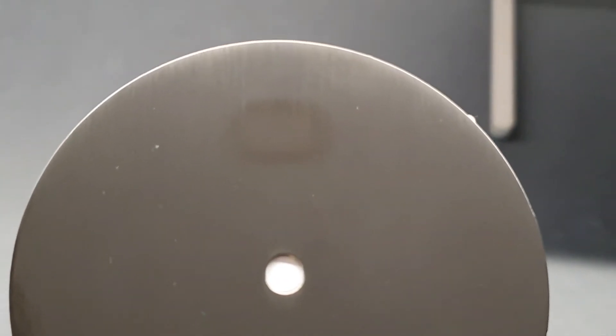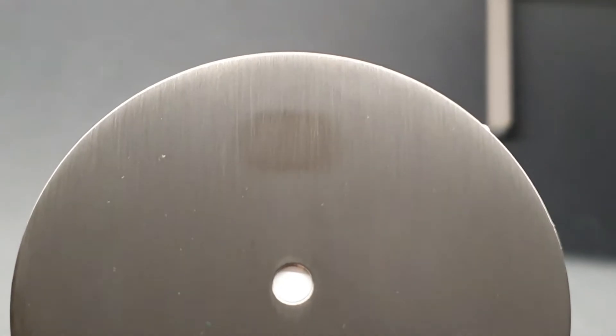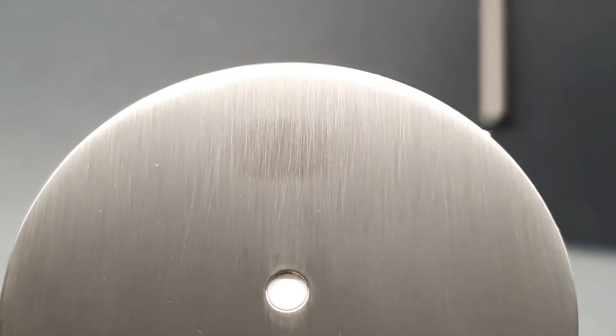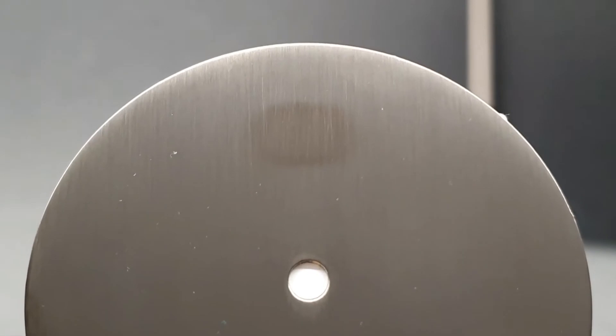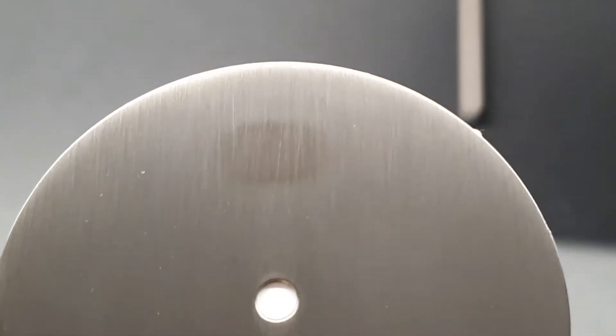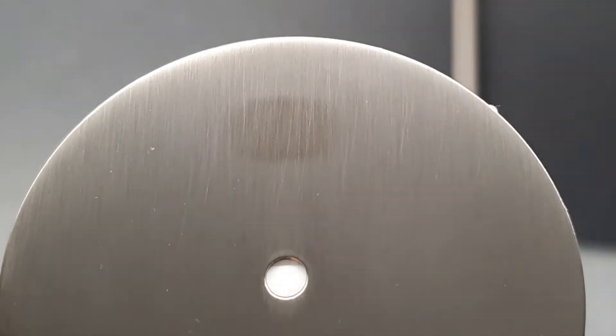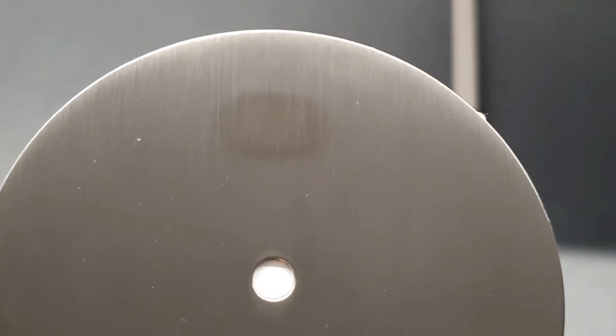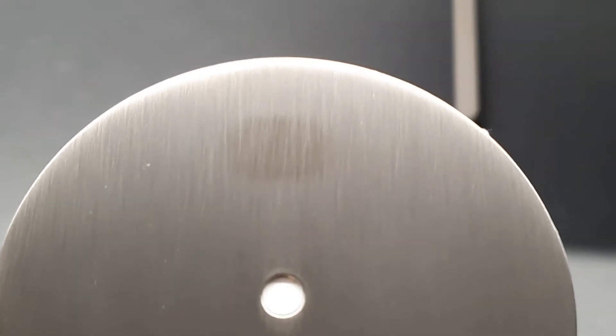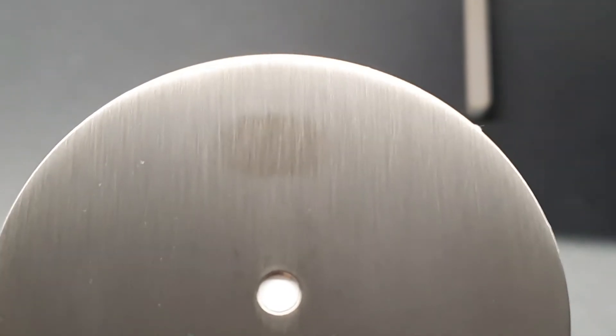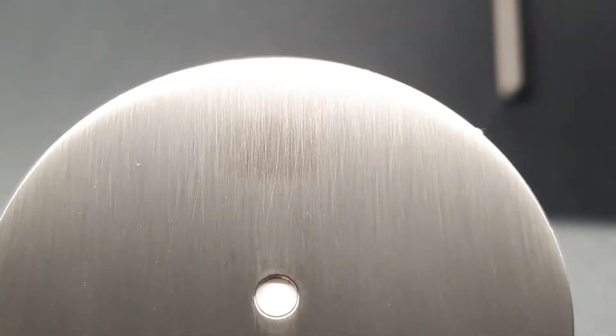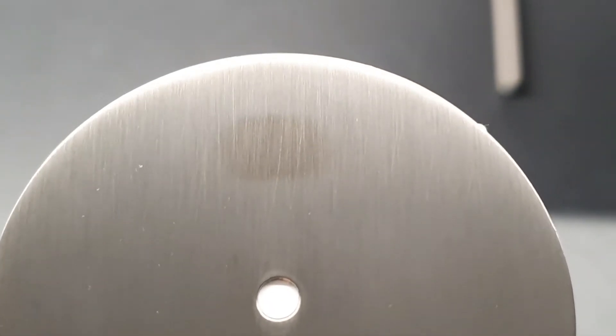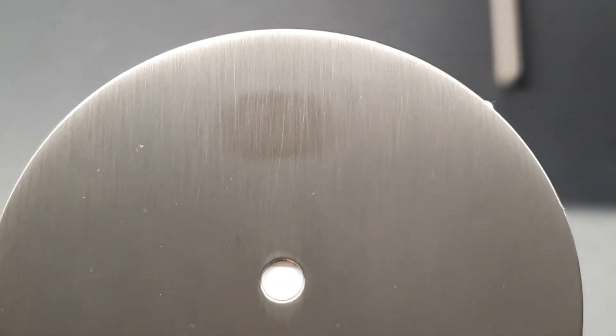This is the PVD coating on the brushed surface. We see a clear mark of where the test happened. It's getting a little glossy at that area compared to the rest, so we assume that there has been some abrasion at the test area. It all depends on the angle of the light.